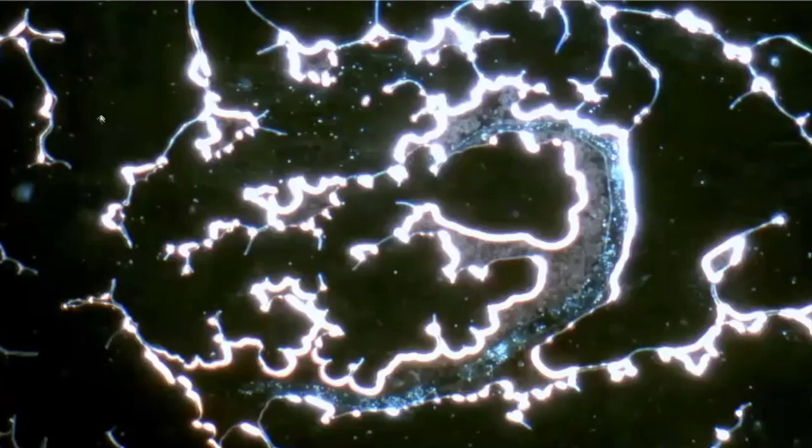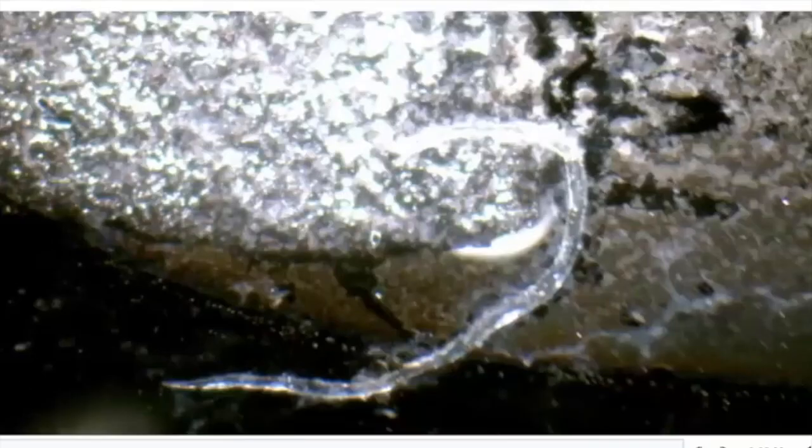So whether somebody will say, oh, that's nanotech growing, or maybe it's just dehydrated blood, we don't know. I don't know, unless I was able to actually analyze the compounds. But it's just an interesting observation that you get these patterns from a dried out blood sample. So I just want to show you what happens when I added MasterPeace to this dried out blood sample. So everything became a bit hydrated again with the MasterPeace going in.